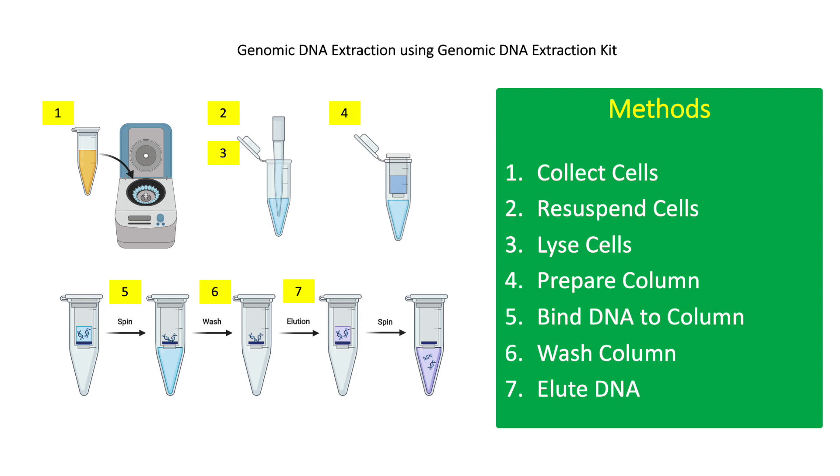For step 5, add 200 microliters of ethanol to the lysed cells and vortex or mix by inversion. DNA is insoluble in alcohol and will precipitate. Transfer the ethanol mixture to the binding column and centrifuge at 6,500 g for 1 minute.